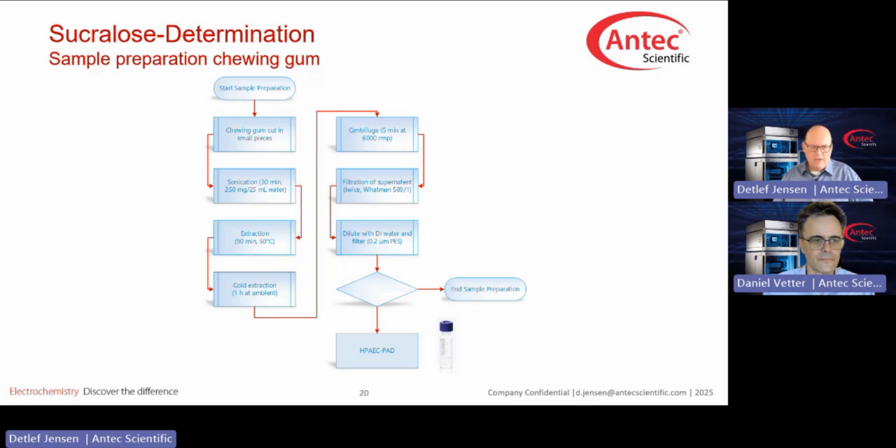I know that. But what I wanted to do with this flowchart is to remind us that it is a pretty clever move, whenever you are dealing with unknown samples, to be on the lookout for sample preparation techniques already developed, like the application notes that we publish, coming with very detailed sample preparation approaches. So use them. Why is that clever? Because colleagues have already spent quite some time to create a detailed approach for sample preparation.